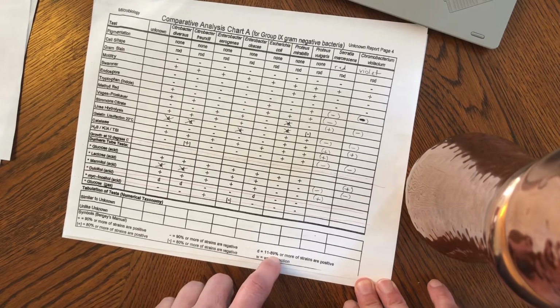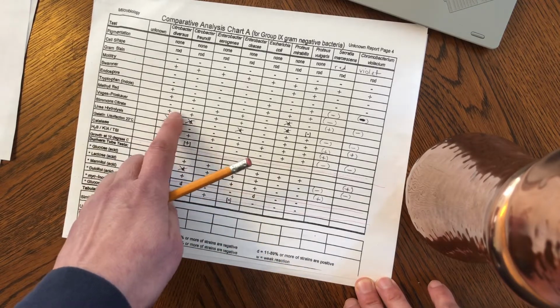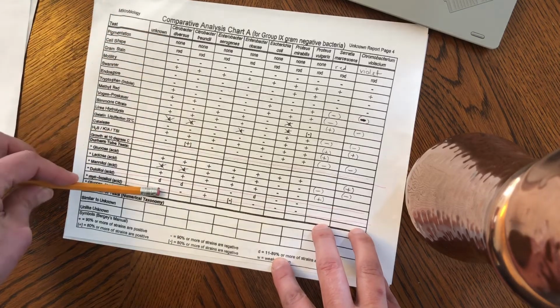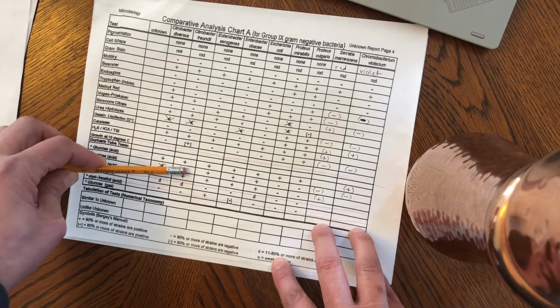Those are really weird, funky ratio results. So where there is a D test result, we're just going to cross it out. And when we count how many bacteria we can compare to our unknown, we're not going to count those Ds.